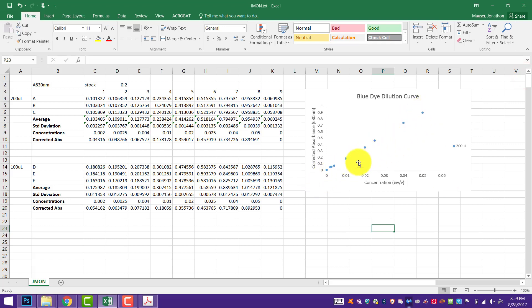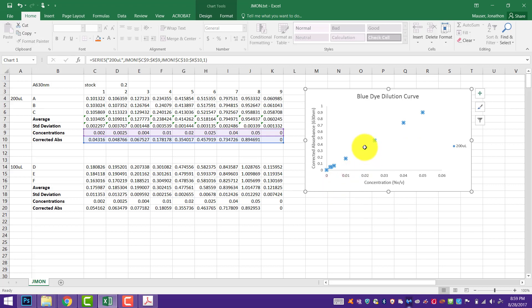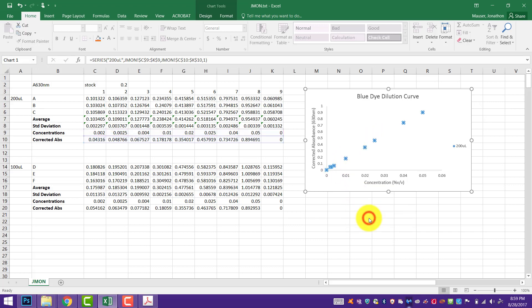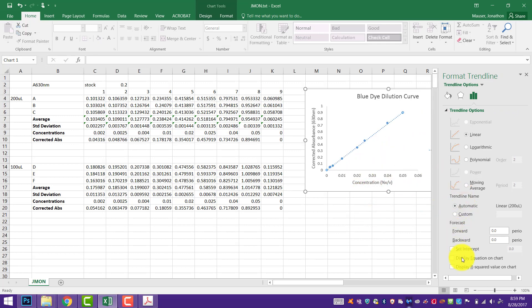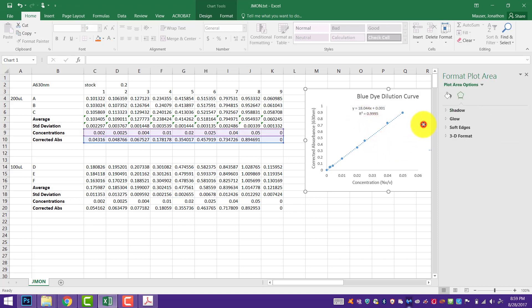Since this is a calibration curve with a linear set of data, I'll right-click on one of the data points to select the whole series, then hit 'Add Trendline.' I always like to show the equation on the chart and the R-squared value, which tells me how good of a fit it is — the closer to one, the better. And that's a very nice set of data.